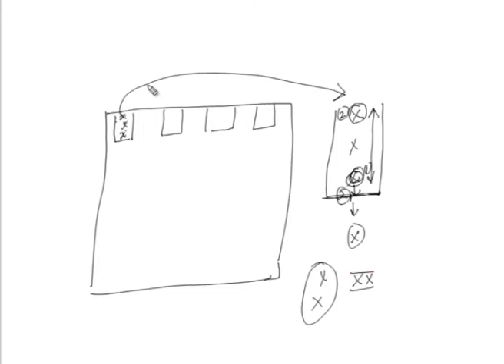So with dilute solutions, running a continuous system is not advisable. But it has been seen for nucleic acids that it does not really make so much of a difference. So for nucleic acids, continuous systems are mostly run, but for proteins, you get a much broader band if it is a dilute solution, and so you will run a discontinuous system rather than a continuous system. So continuous systems are not advisable in the case of proteins.